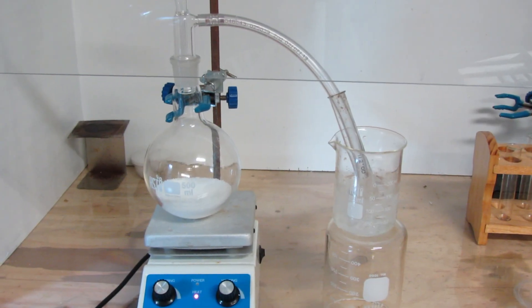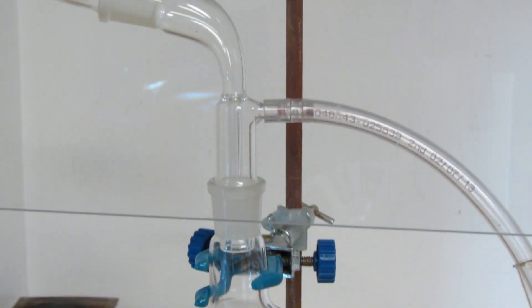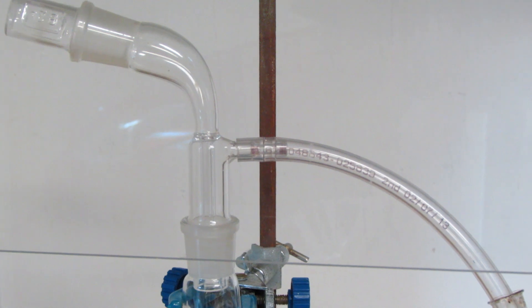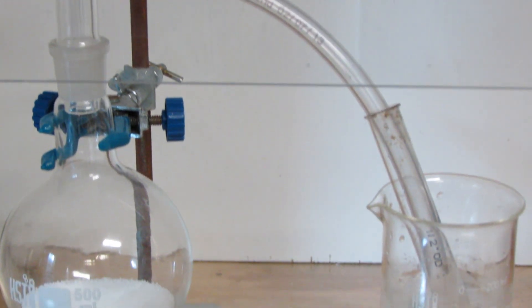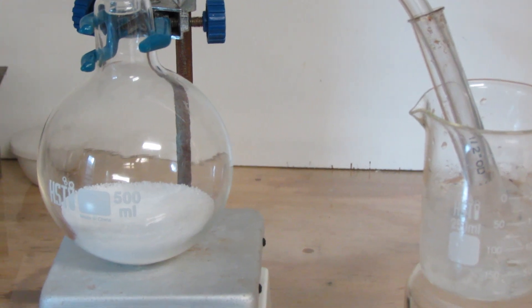Now assemble a simple gas generator setup. I just attached a vacuum receiver to the top of the flask and stopper it. This way I can attach a hose to the little hose barb, and now I can bubble the gas produced through the water in the test tube.